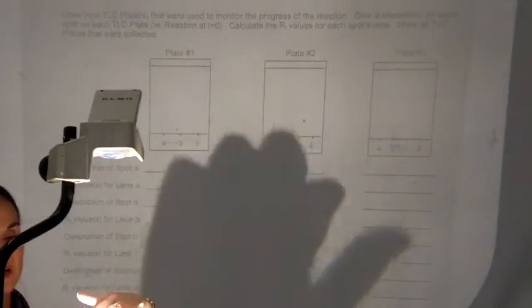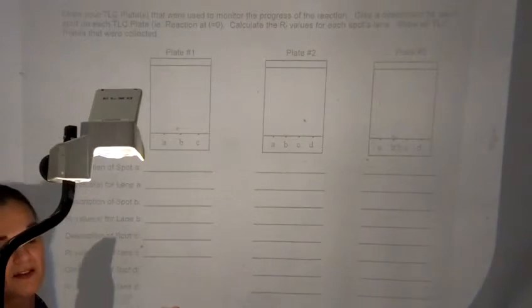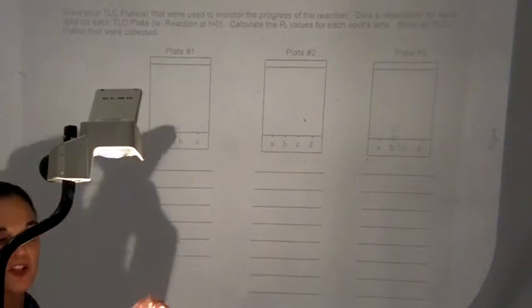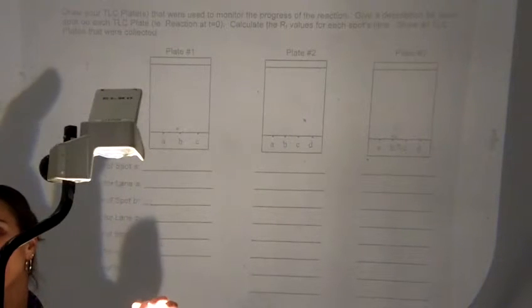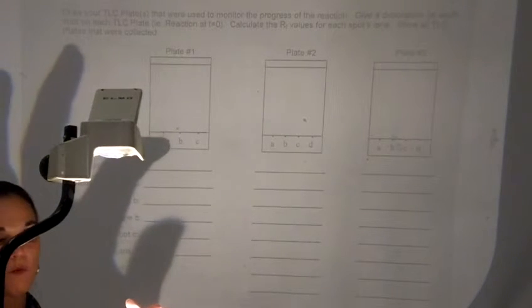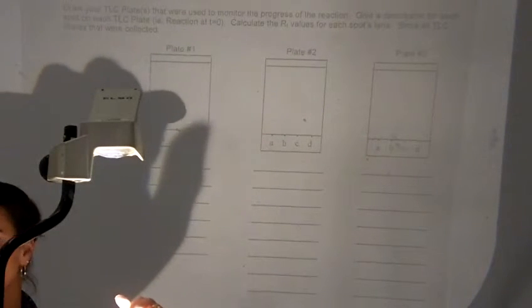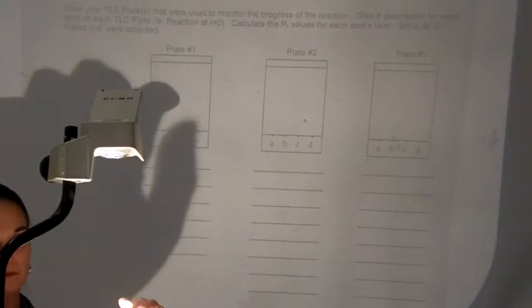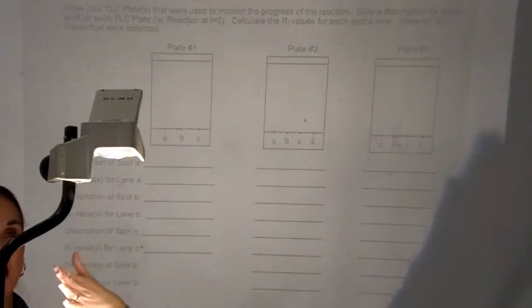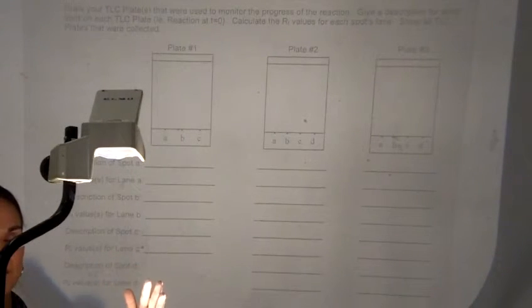Then for each of the TLC plates that you develop, you want to draw on this sheet what the TLC plate looked like, okay? And the description of A is what that spot is. So is it the reactant standard? Is it the reaction at time 0? What does A represent as far as your TLC plate? So give the description and then give the Rf values of all the spots that you see in there, okay? So you'll do that for however many plates you develop, 2 or 3 plates. Probably not more than 3 plates.